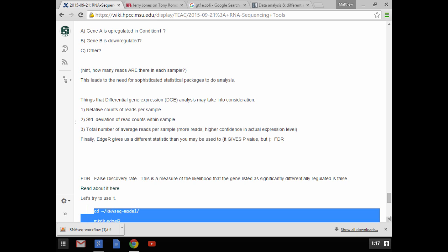The take-home of that is don't try to do it from raw numbers. And really, given the amount of sophisticated statistical analysis that is available in the world, don't try to do it yourself is probably the secondary message of that. Let one of the tools that exists do it for you. If you're using EdgeR, let EdgeR do the work and then figure out what the answers are. Don't try to figure out exactly how it did the heavy lifting, unless you really care and you want to get a second PhD in statistics.